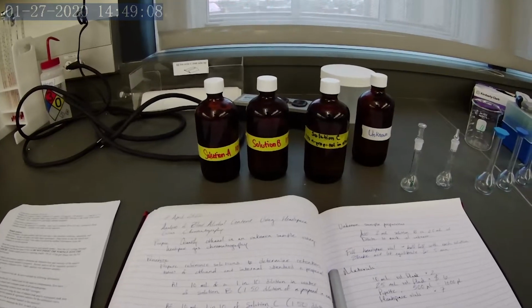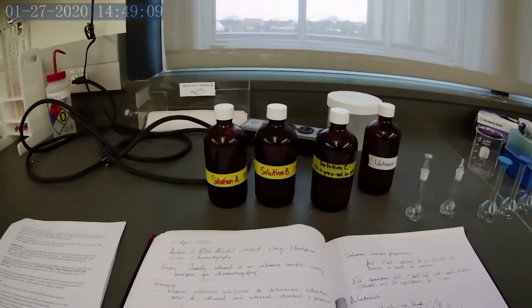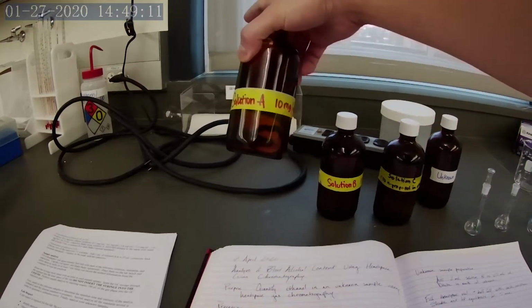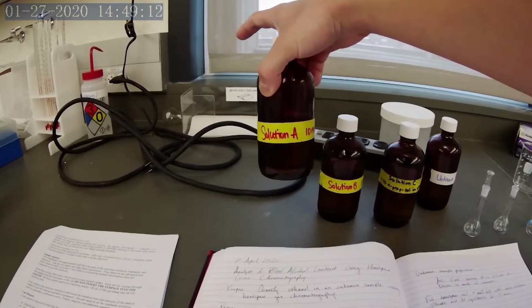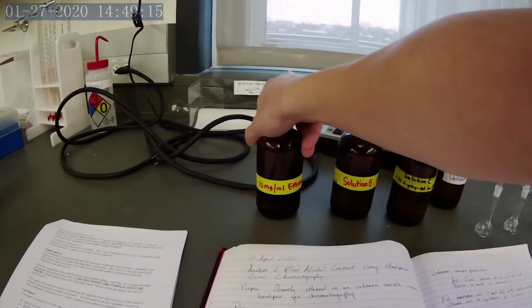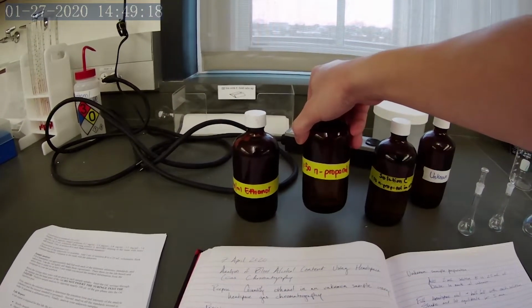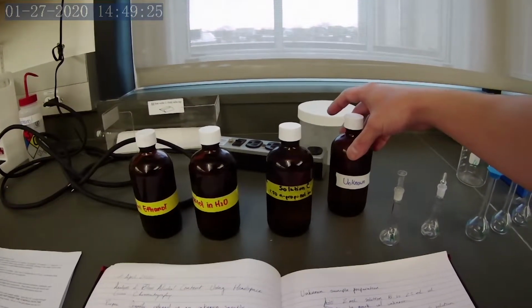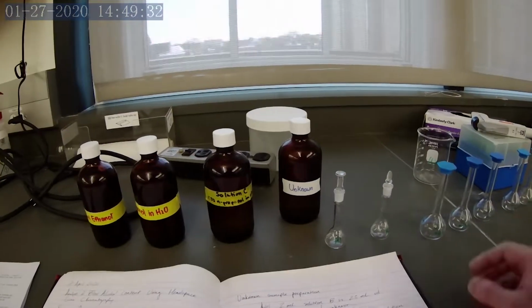These are our materials for the lab. Solution A is a 10 mg per mL solution of ethanol and water. Ethanol is the compound that we're measuring for. Solution B is propanol, our internal standard, diluted in water. And solution C is propanol, again, just diluted with the ethanol solution A. And then there's the unknown sample that we're going to measure.